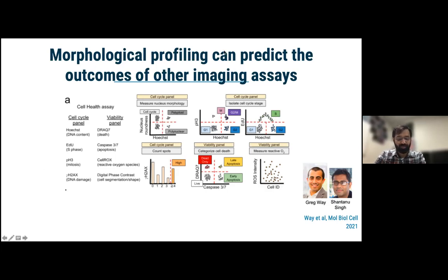I really look forward in future to the JUMP cell painting database that will come out, and DeepProfiler, which sounds very exciting. I guess the whole deep word is kind of dumbing down everything that one has to think about. Press one button and boom, everything comes out on the other side. So that's going to be exciting.